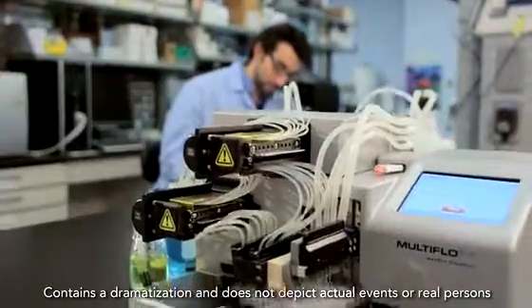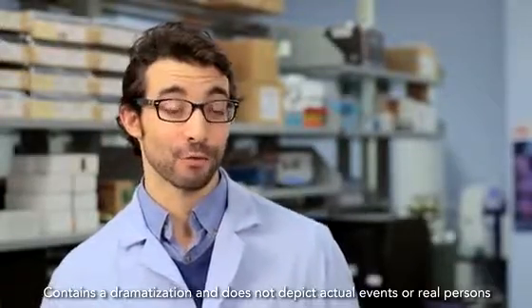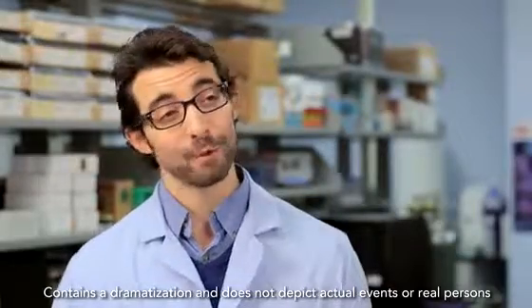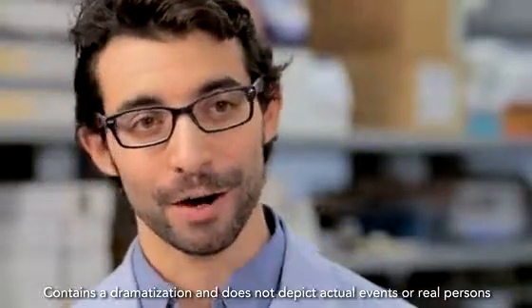That's why we made the switch to the Multiflow FX from Biotech. We've been using the same dispenser in our lab for a long time, but when we demoed the Multiflow FX, it was clear that Biotech had really raised the bar.